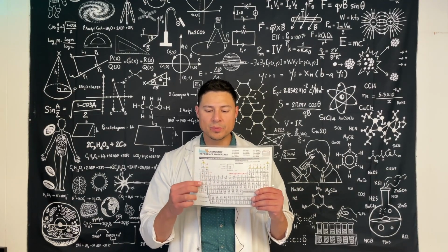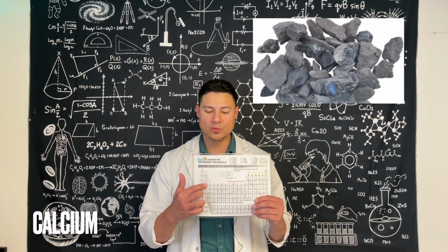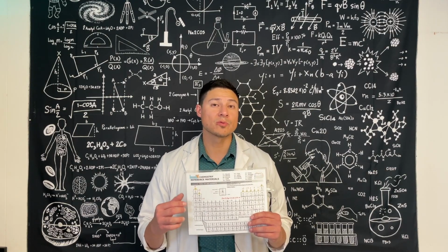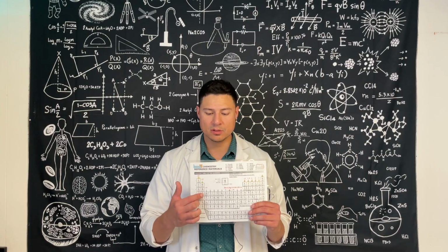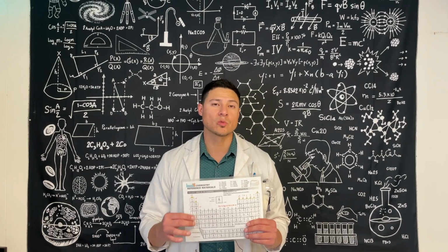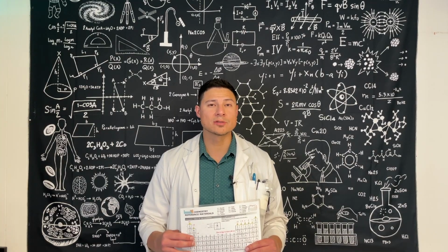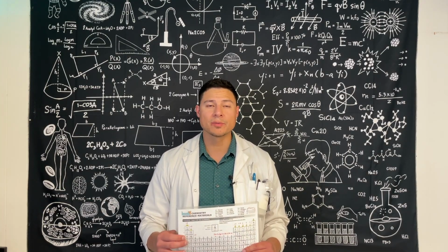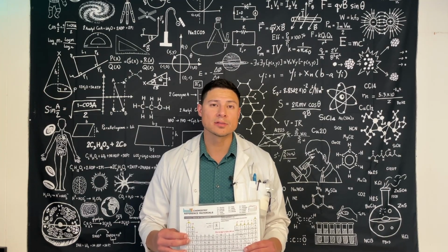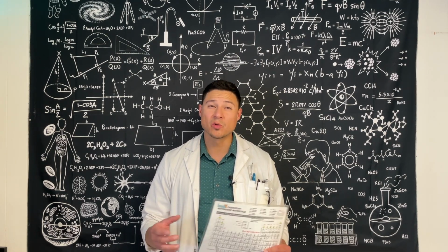And then I have purposefully chosen a compound that has calcium in it. So we're going to test calcium, which is right underneath magnesium. They're in the same family, and see if we can identify some type of reactivity of these metals from the same family. So when we look at the bottom to top or top to bottom, which one is most reactive? So use your observation skills to try to determine what is going on in each experiment. As we test each one in water, we're going to see if we can determine a reaction and see which one is most reactive.